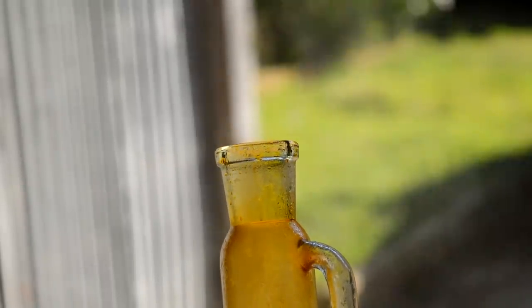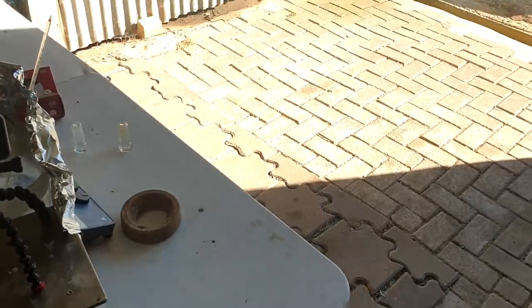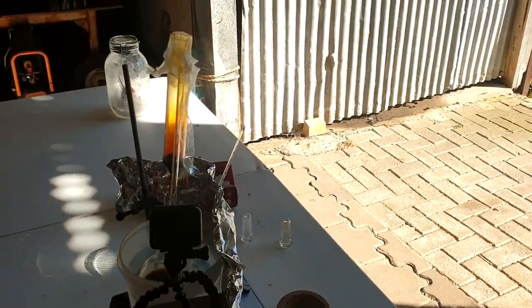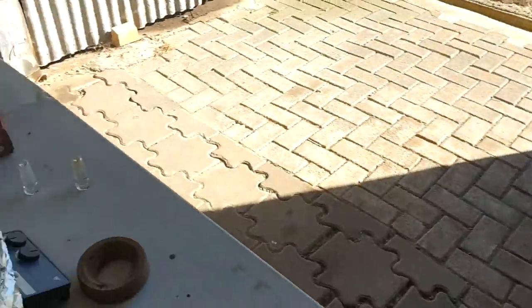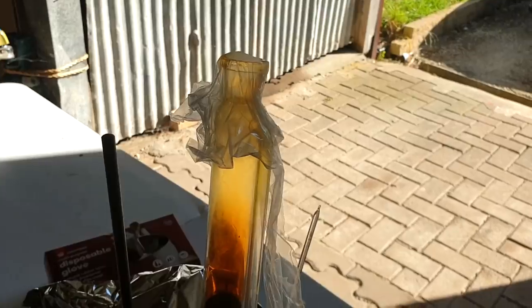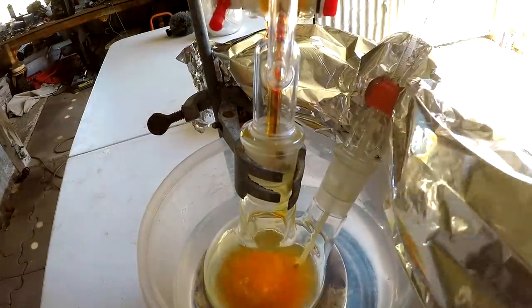So, yeah, not heating up a lot, adding the bromine reasonably fast now, but it is putting off a lot of gas. I think that's a sign it's working, right? I think so. Anyway, pretty goddamn corrosive. Really can't put the stopper on there. I could before, but now it's producing heaps and heaps, so.